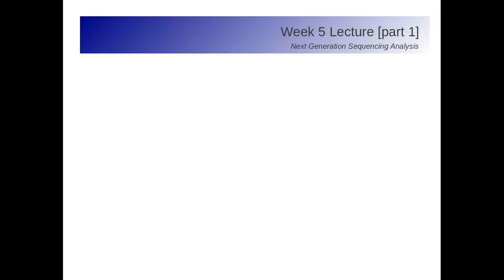So what do I mean by a SNP calling pipeline? Just briefly, what I'll be outlining today is the process for how to go from raw data, that is the FASTQs coming off of a standard next generation sequencer, all the way through to the SNP calling step. The SNP calling will be reserved mostly for week 6, but all of the alignments and the processing of the aligned reads in preparation for SNP calling is really the subject of this lecture.